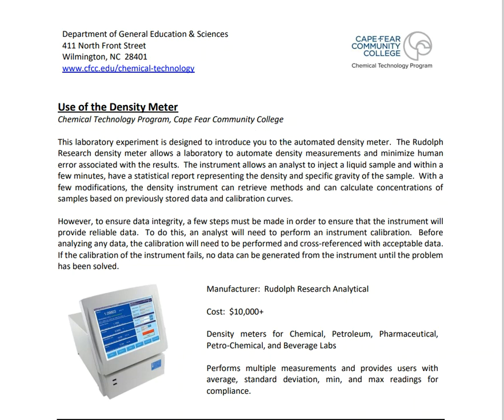Welcome to your next laboratory, and this laboratory is going to concern the density meter. Depending on how you've been structured, this could be your first lab involving density, or it could be your second lab involving density. The reason is because we cannot bottleneck at the machine. The density meter is very automated, which makes our life much better, but the true problem of this density meter is time. That's right. It's going to take forever to run a sample.